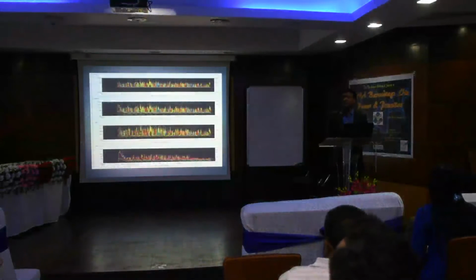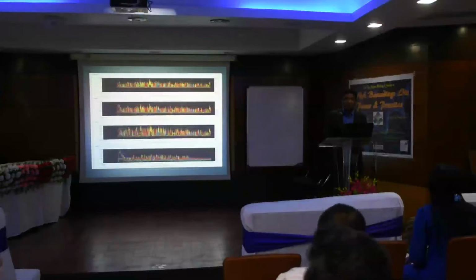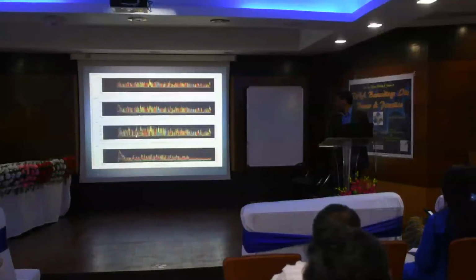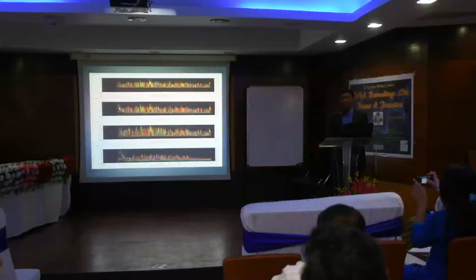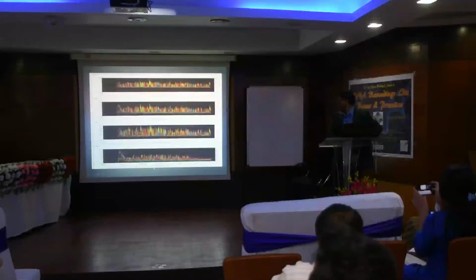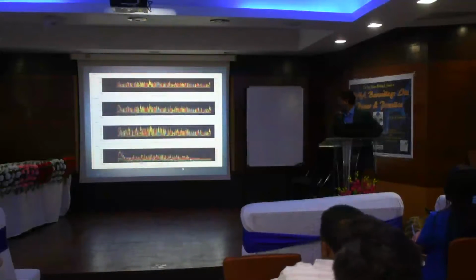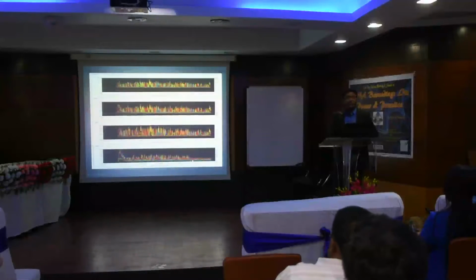This is typically an electropherogram of a sequence. On your sequencer machine only you can see it; other places you can't see it. Only your sequencing facility can show you. If you have such sequences, this is wonderful, this is good. Here you have a little high salt. This blobbing is due to high salt concentration. These are also good quality sequences, but here the quality is going down when you reach 600, 550 and above.